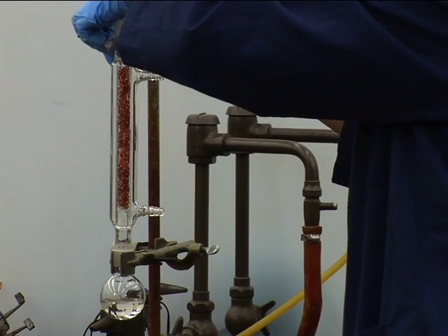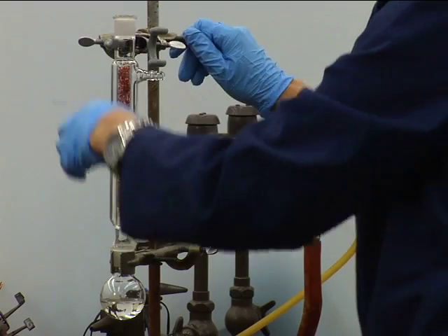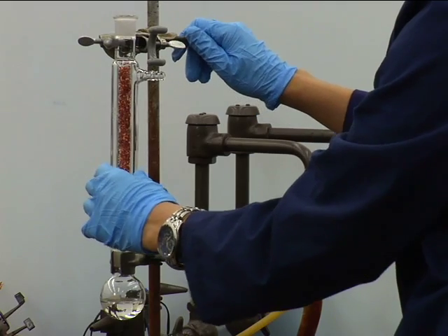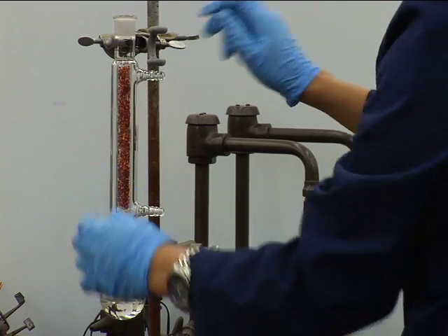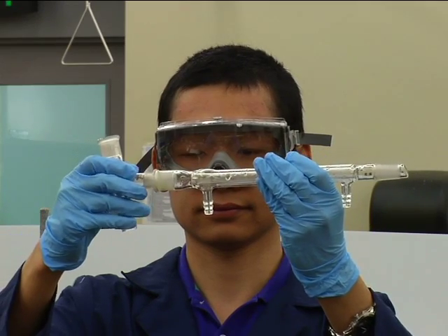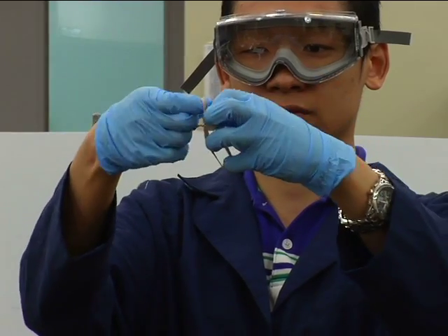Clamp the fractionating column very loosely with a large three-finger clamp. This is important — this is not a support clamp. It only prevents the still from tilting to one side. If you clamp it tightly, you may disturb the alignment of the ground glass joints and cause a vapor leak, strain on the glass, and breakage.